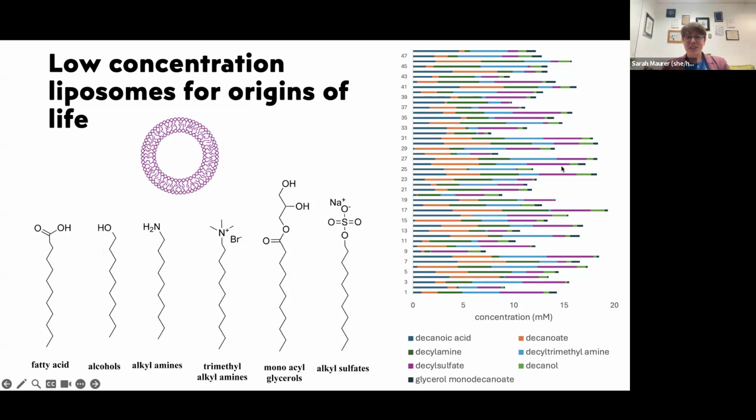All right, next question. How do you describe the fatty acids? Is it one hot encoding? Have you considered using other physical descriptors? We have.